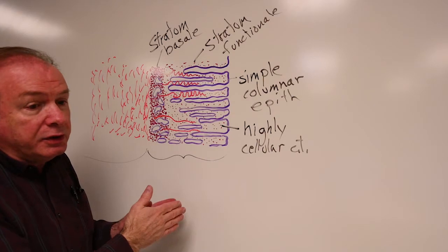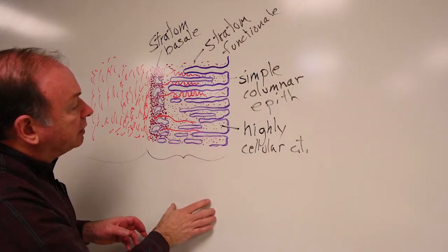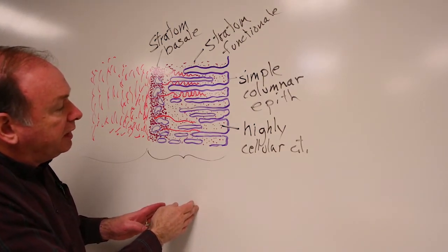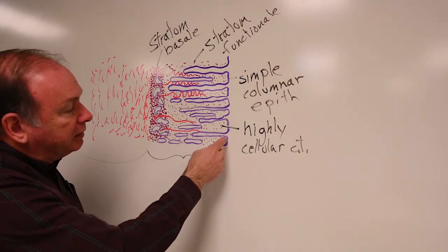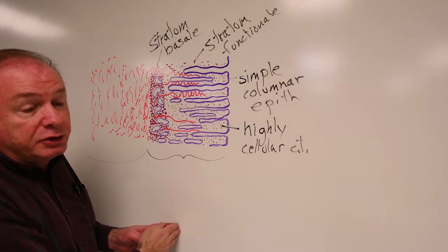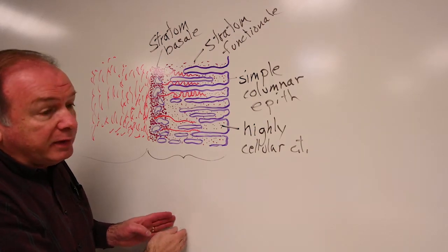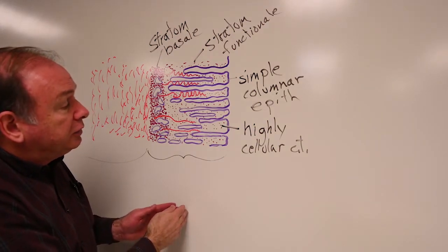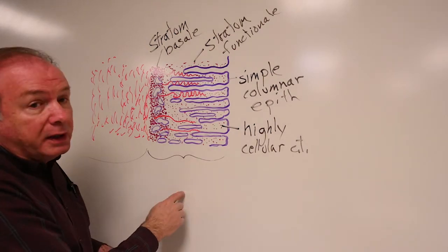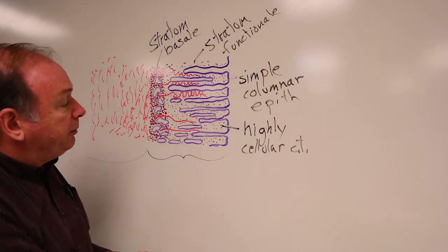Now, down in the cervical canal, we still have some glands to occur down in the cervical canal, for the first part of it anyway, but eventually you replace the columnar epithelium of the surface with a stratified squamous epithelium, the same kind of epithelium you find in the vaginal canal. So you transition in the cervix from columnar epithelium to a stratified squamous non-keratinized epithelium.